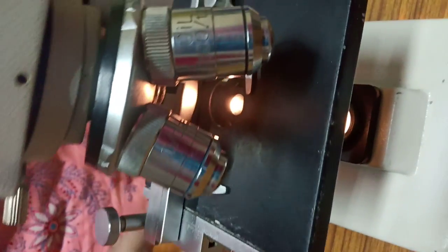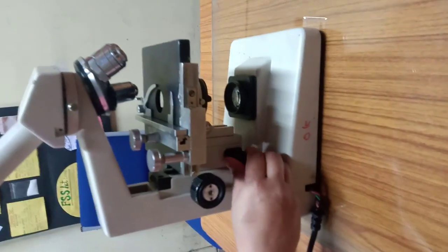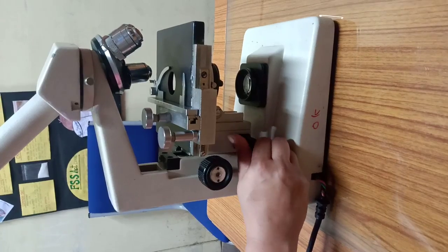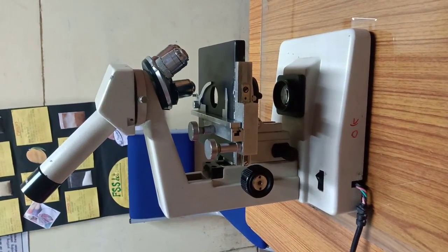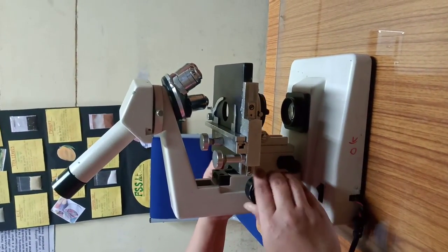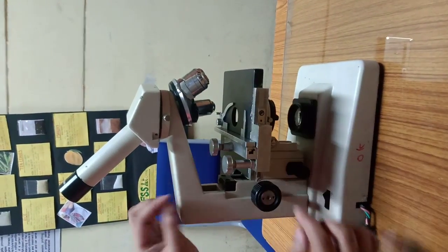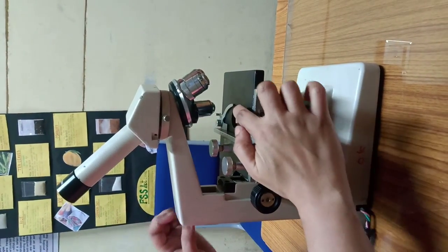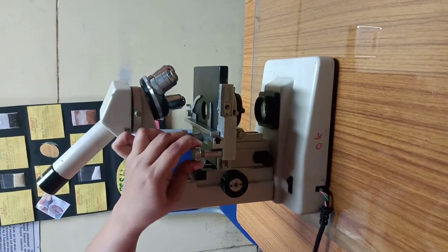Now there is a coarse adjustment knob. Here you see, students, a coarse adjustment knob, and a fine adjustment knob. Now this is a very important thing to note. They are maintaining the distance between, what is this? This is the stage. These are the stage clips. And to move these stage clips, you have 2 knobs.